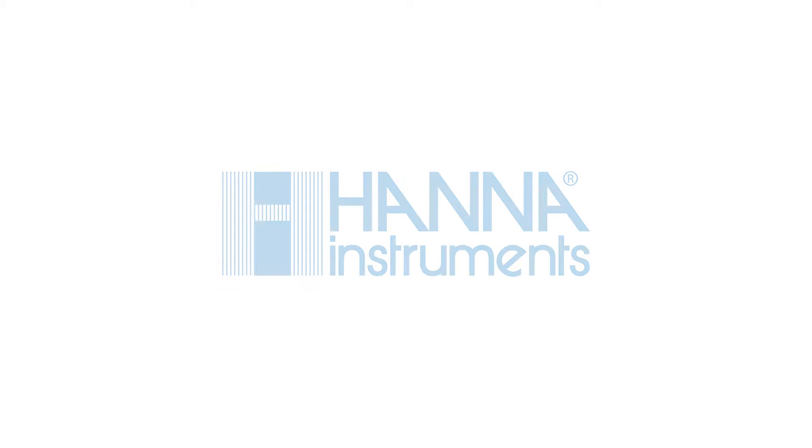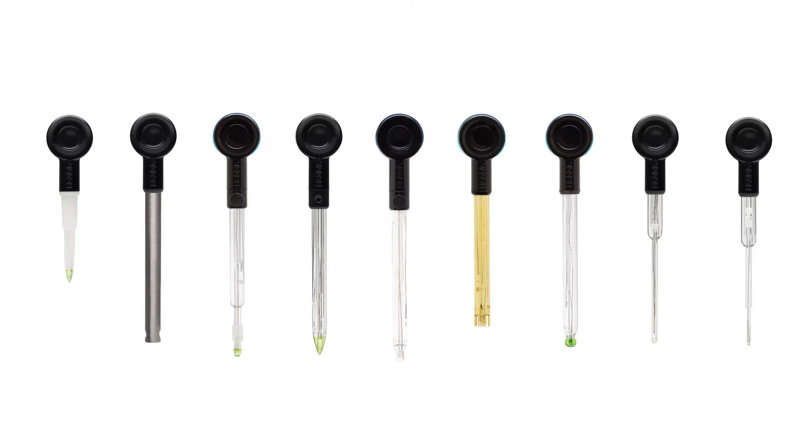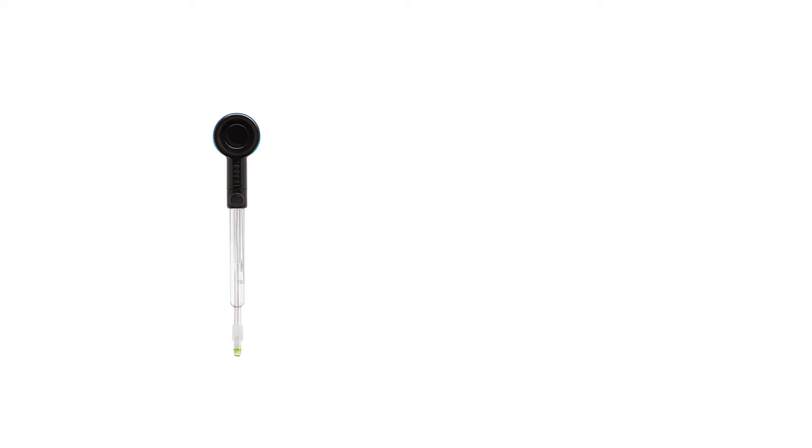The world's first wireless pH meter with built-in Bluetooth, paired with a HANA Lab app. Designed for industry professionals and hobbyists, the Halo wireless pH meter line meets your needs. Let's take a look at the HI10482 Halo, designed for wine and juice.